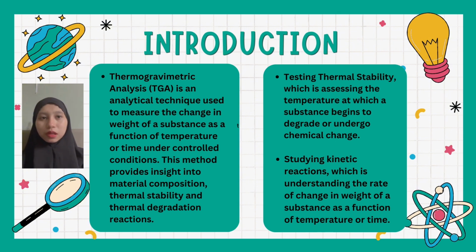Firstly, I want to explain about the introduction. Thermogravimetric analysis, or TGA, is an analytical technique used to measure the change in weight of a substance as a function of temperature or time under controlled conditions. This method provides insight into material composition, thermal stability, and thermal degradation reactions.